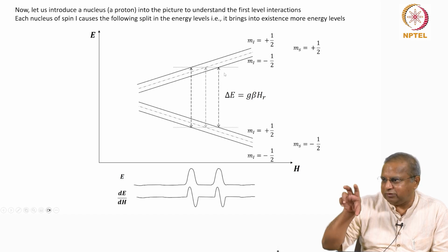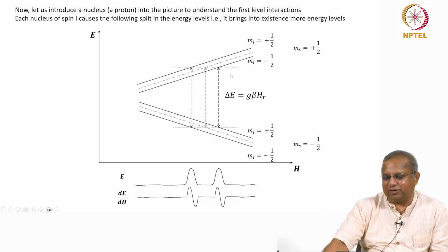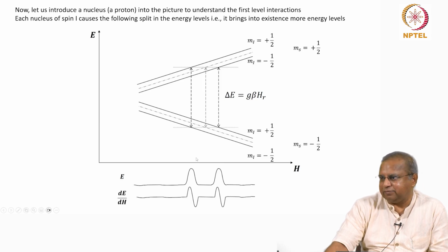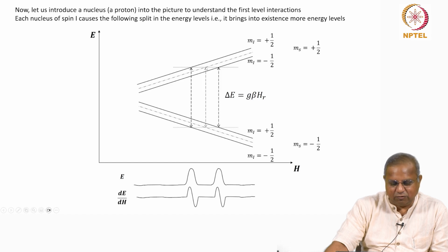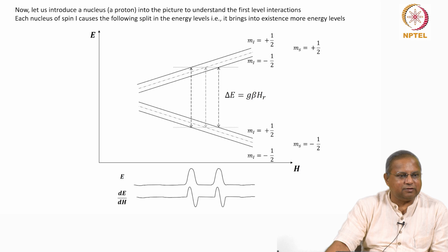It's an optical illusion which makes it look something like this. It's exactly the same. They're all straight lines that I've drawn. So this delta E has become possible at two different HRs or Hs, let me say. So this no longer exists because the proton has come in. Instead, this has become possible and this has become possible. It will switch at this value of h as well as at this value of h, because the resonance condition is matched there.